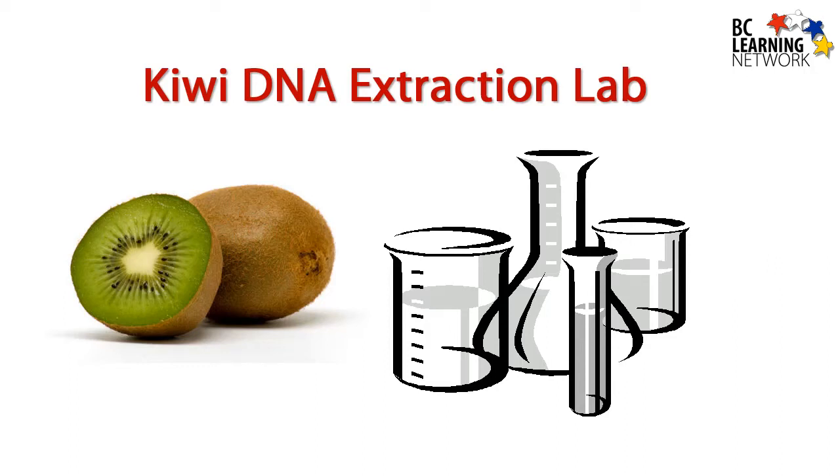The DNA extraction lab is an extraction that is easily done at home. A couple of hints here: be sure to crush the kiwi really well, use a clear liquid dish soap, and make sure the isopropyl alcohol or ethanol is cold. The isopropyl alcohol can be found at your local pharmacy.